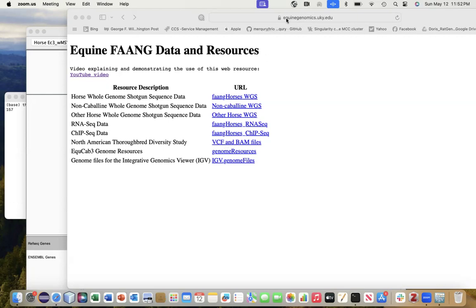To get to them, simply go to the equinegenomics.uky.edu site. You'll see the North American Thoroughbred Diversity Study description here, and click on the links, VCF and BAM files.